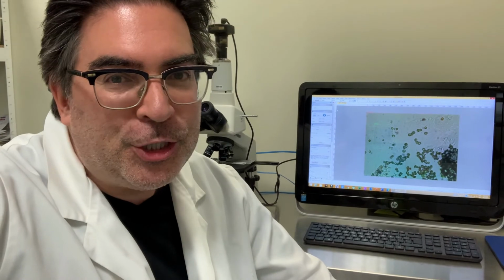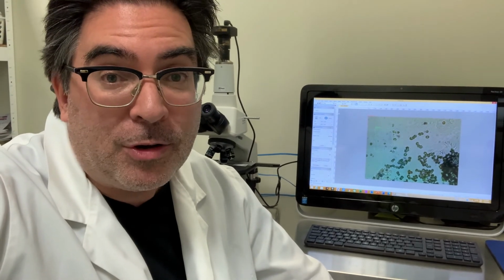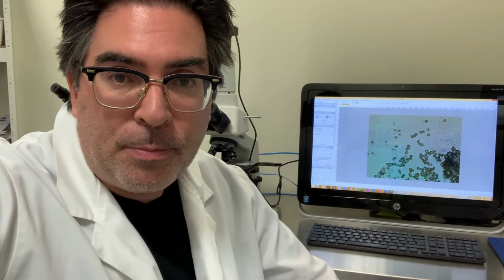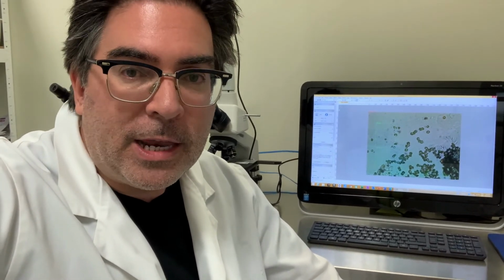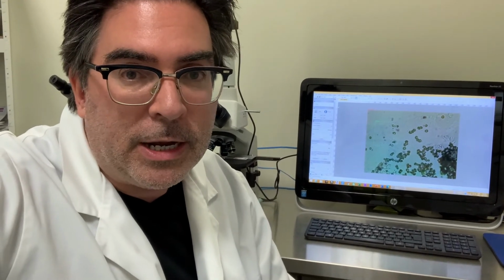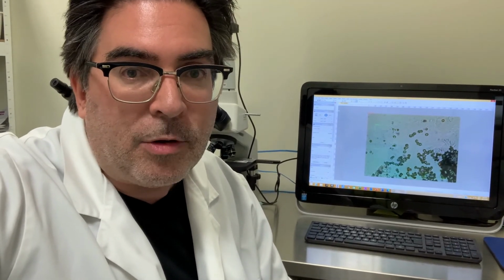So the Petri dishes show you exactly what is found growing inside these toys, but it doesn't tell us the whole story. I've been able to make slide preparations from the Petri plates to see exactly what type of microorganisms are inside those toys and inside the biofilm, and it's not pretty. There were fewer fungi than I would have thought. There were lots of yeasts, and there were two types of bacteria that we call gram-positive and gram-negative.